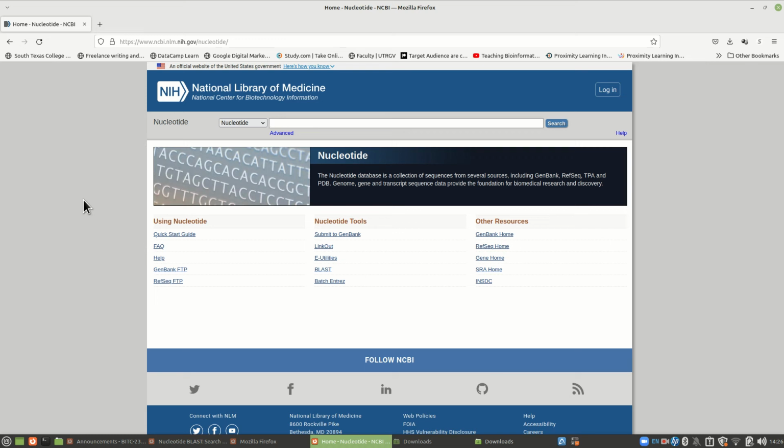All right, for the last part of Project 1, you're going to need to be able to compare your sequence to another organism. So, pretty straightforward here, but you need to go download something. I'm going to restrict you: no apes. In other words, you're going to compare your version 2. So, first, let's do that.